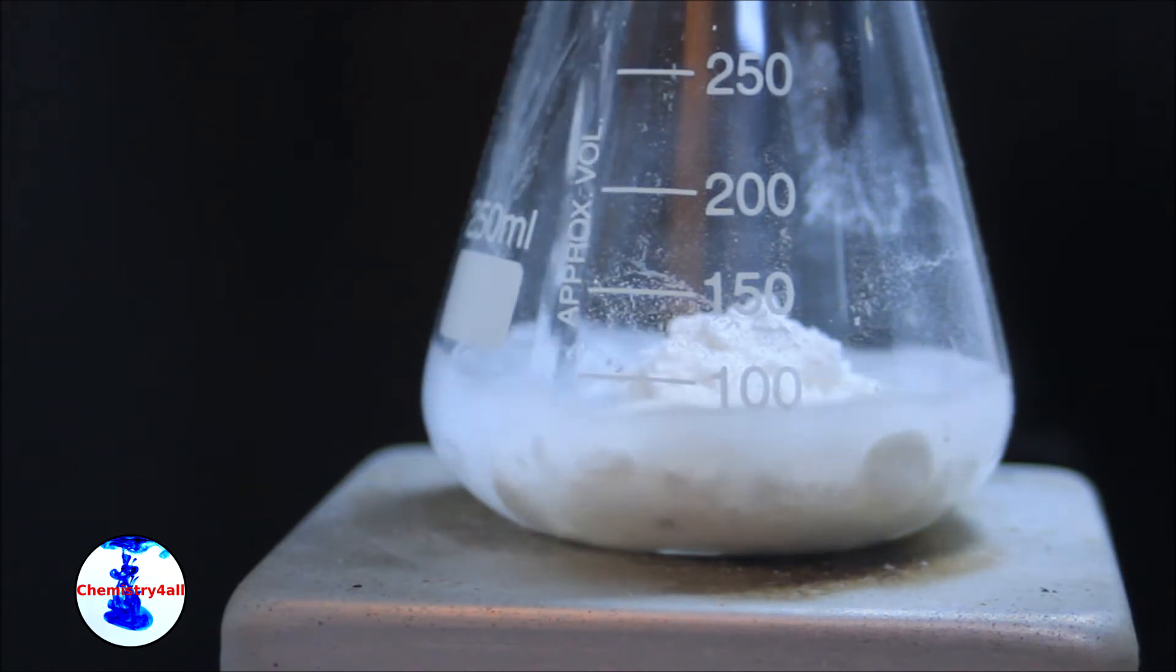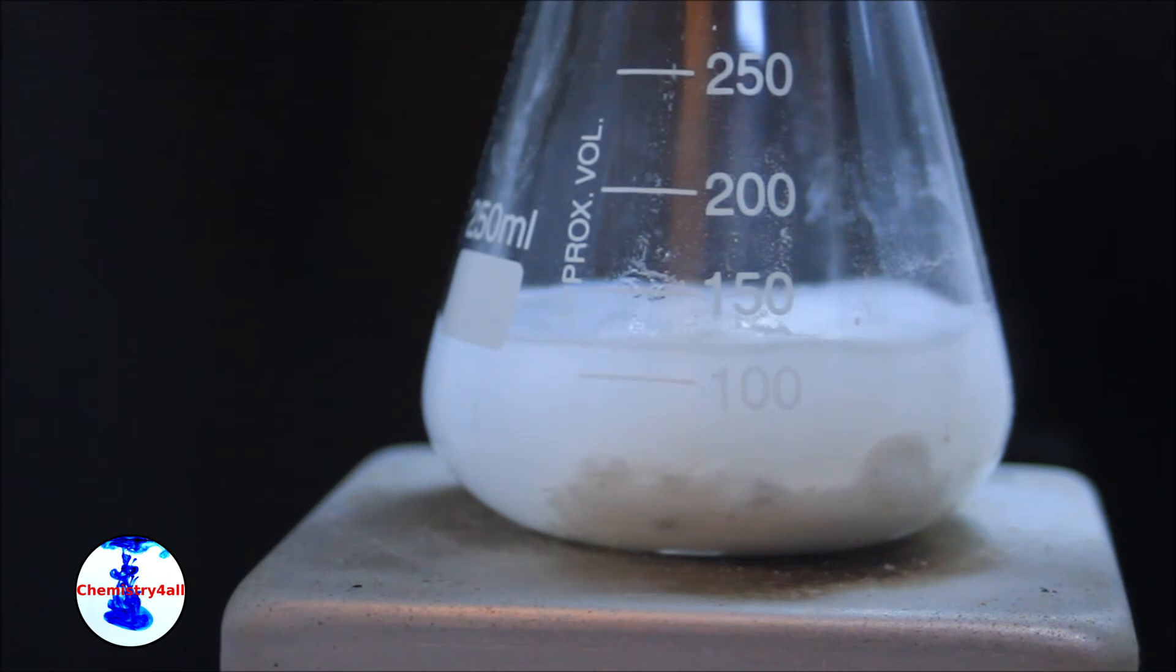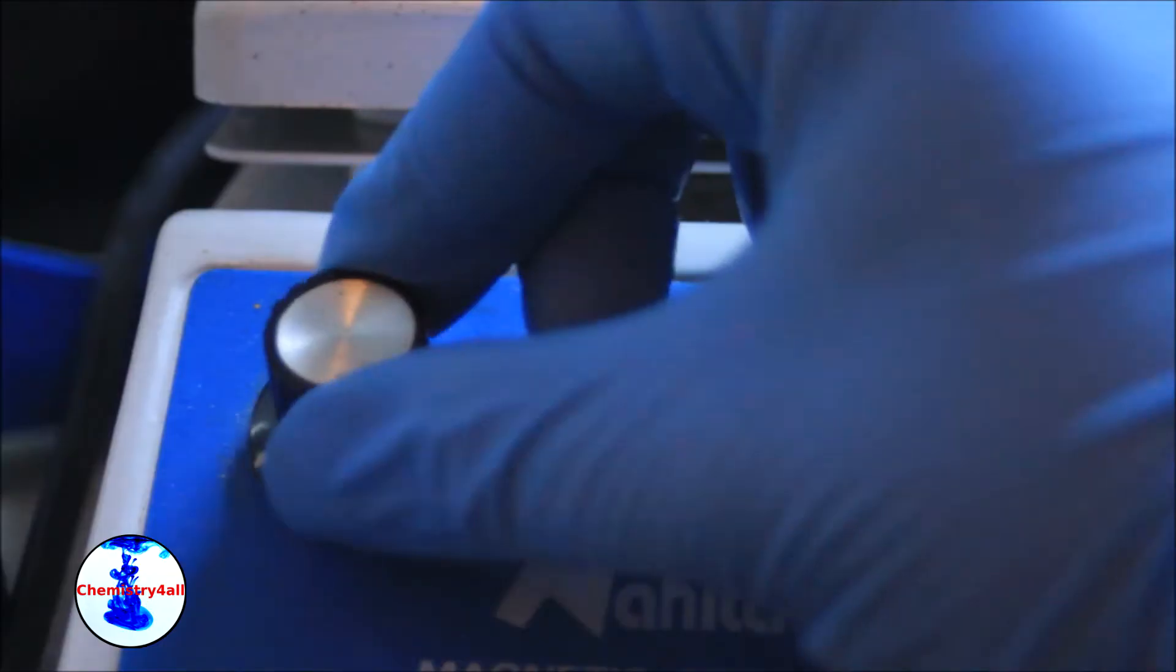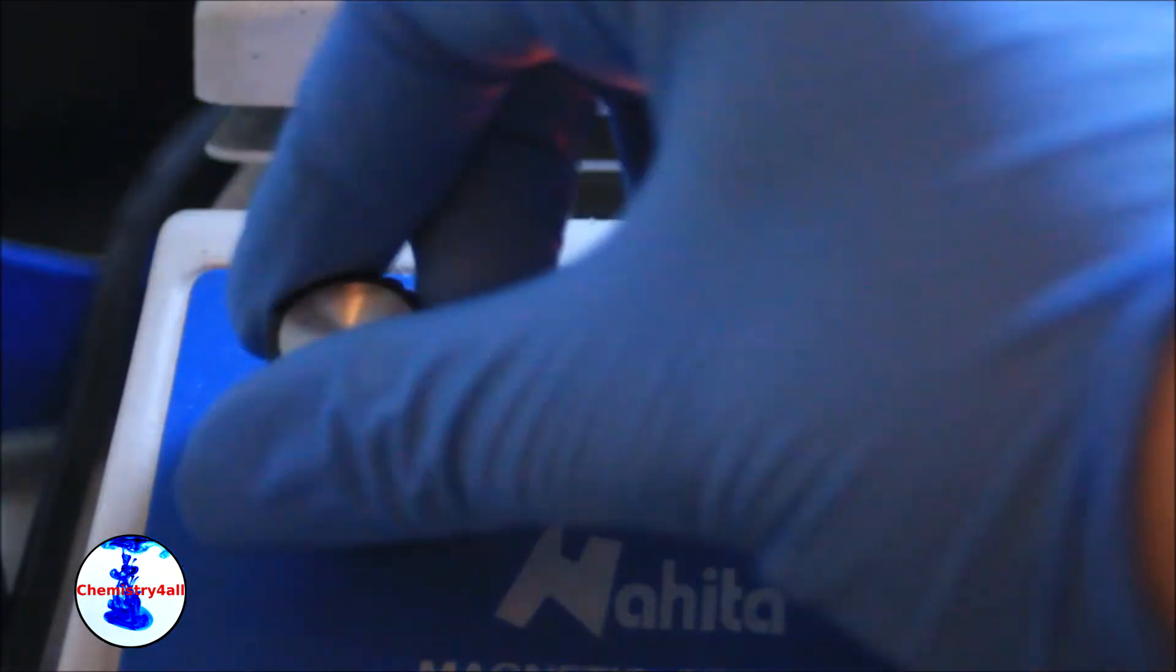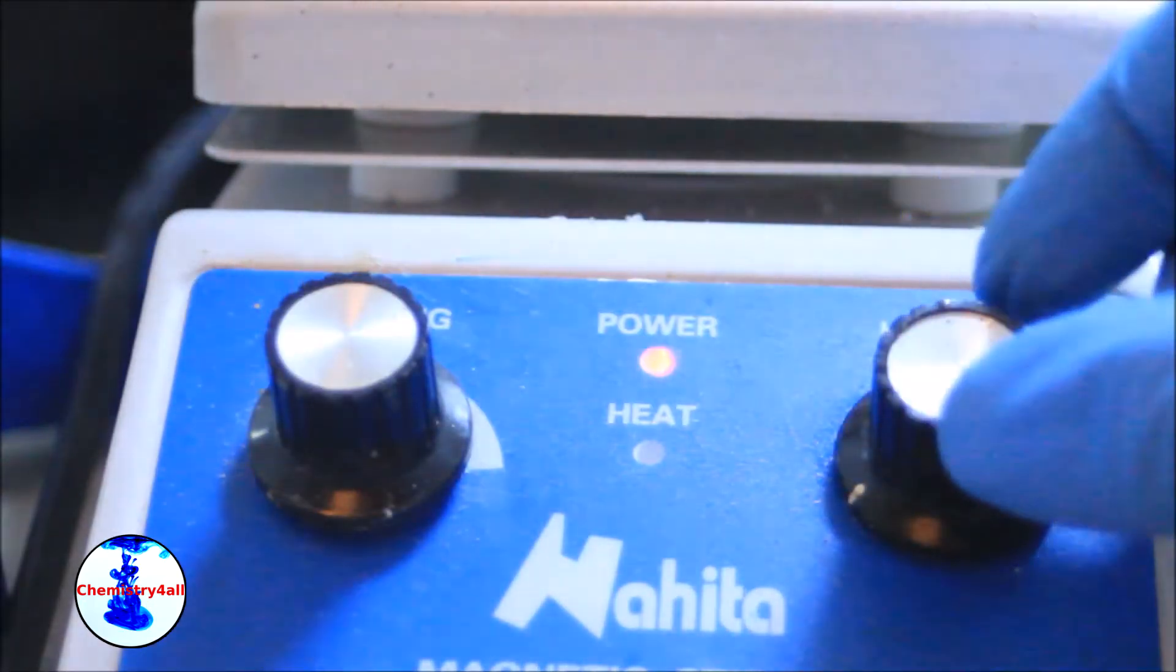Finally a reflux condenser is attached on top of the flask. This will keep a constant solvent level during the extraction. The system is then heated under constant stirring for about an hour and a half.